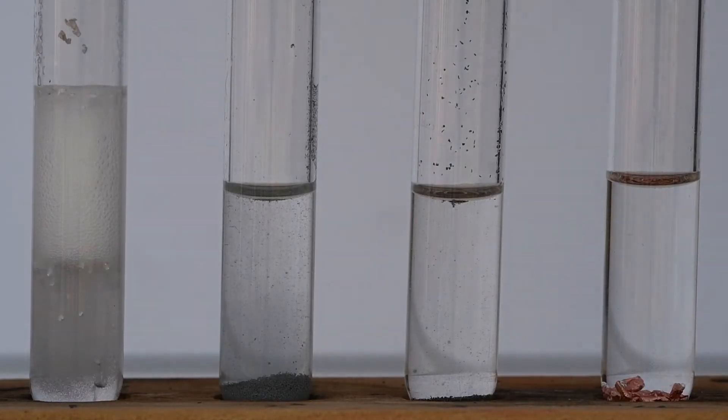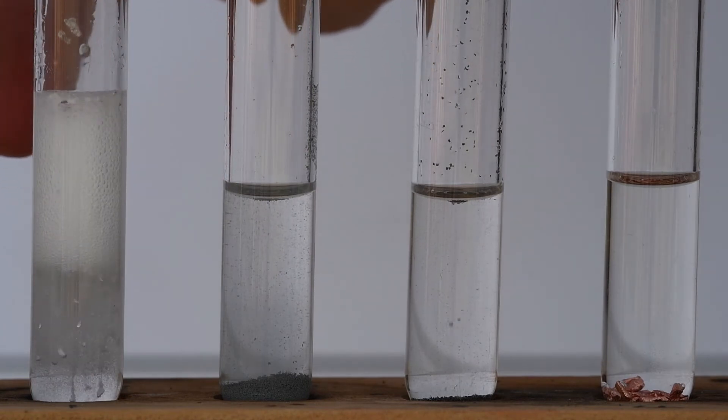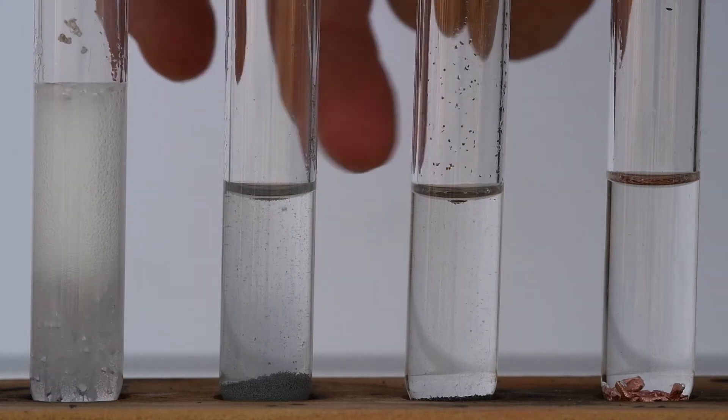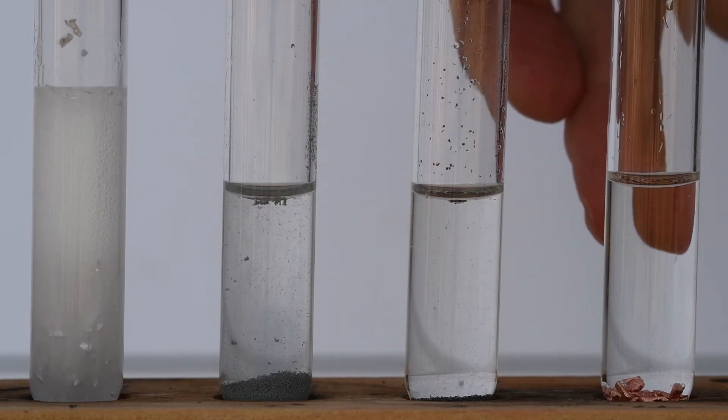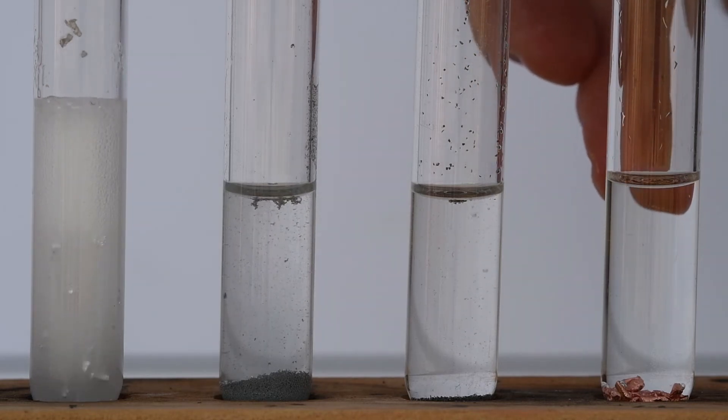You can immediately see there is a difference in reactivity, so the magnesium is definitely reacting fastest. The zinc and the iron at the moment look to be behaving in a fairly similar way, and as expected there's no visible reaction with the copper.